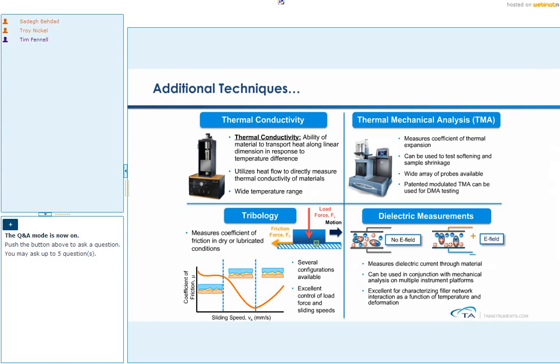So we discussed several methods today, and because we were limited in time, we didn't go into detail about some of the other methods. But just to briefly mention them, you can also look at the thermal conductivity of your material. For example, in the heat buildup test, when we were talking about how that heat is trapped inside that rubber cylinder, a part of it could be because adding different types of fillers and achieving different dispersions is also changing the thermal conductivity.